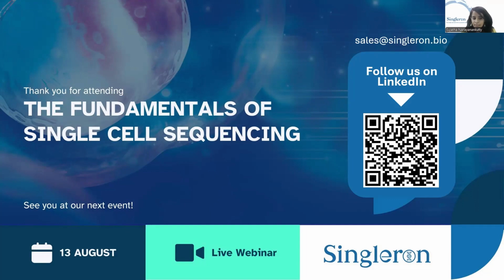For most of these known noises in single cell data, there are published algorithms, scripts and suites of analysis that you can run your data through to make sure that you are discounting or removing most of the noise and keeping only real signal. Of course, it helps when you have more data points rather than less, to help understand what's real biological signal and what's background noise.